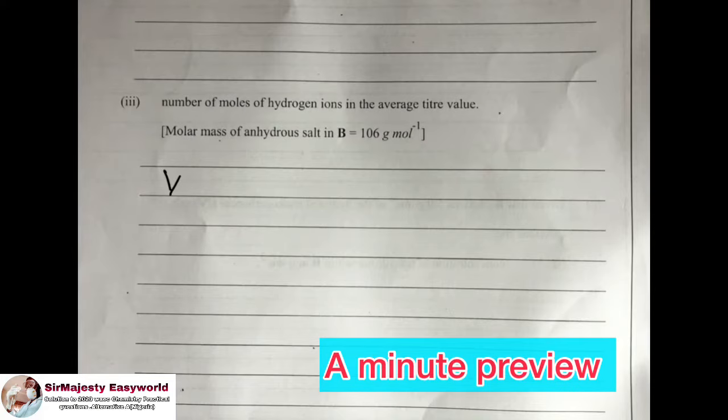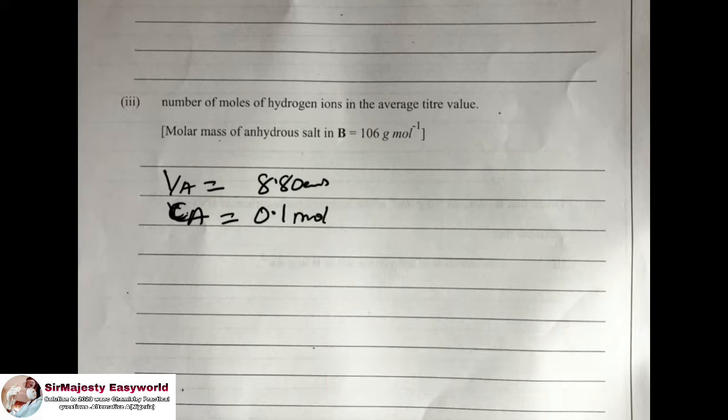The average titer value, which is VA, the one I used here is 8.80 cm cube. Then you go back, what is your CA? Yes, what's the concentration of the acid? The CA from the information given is 0.1. Therefore, this 0.1 means the amount in 1 dm cube.